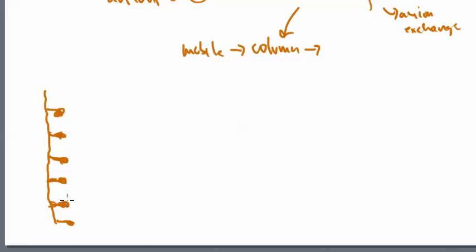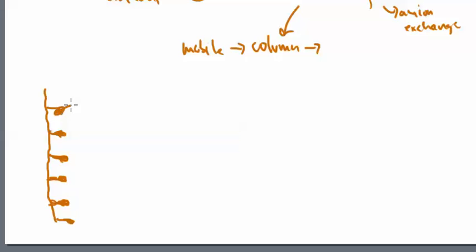And off of these groups, off of this structure, let's say that we want to exchange cations. Well, okay, that means I need something that will attract the cations to the stationary phase. And one of our poisons of choice is SO3 groups. So if I can put an SO3 group there, I've got these oxygens with these electron pairs, I've got this thing that carries a negative charge with it. Well, what begins to happen is that it serves as a magnet.